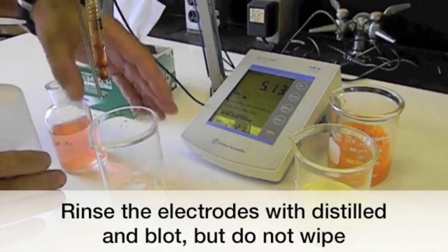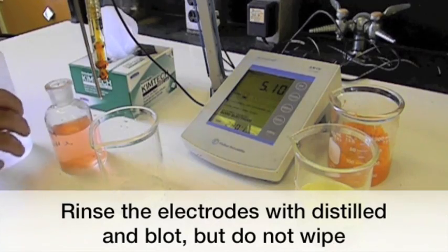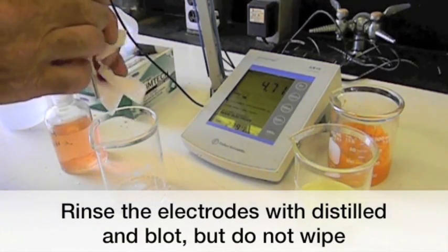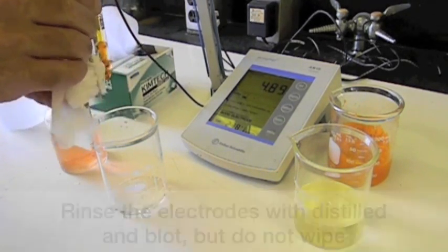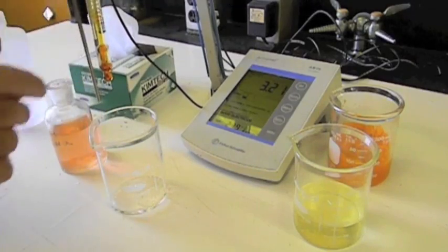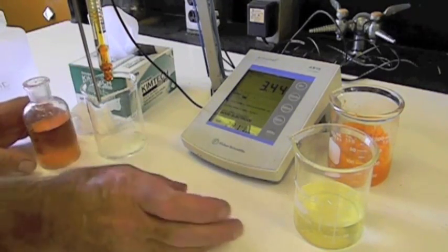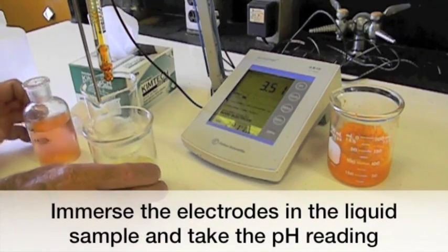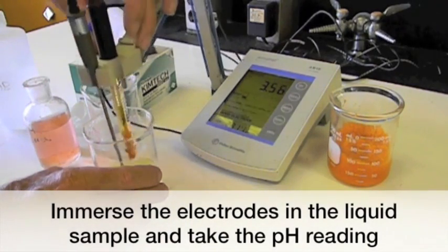Calibrate the pH meter and adjust the sample temperature to room temperature before measurement. Rinse the electrode with distilled water and blot. Do not wipe. Immerse the electrode in the liquid sample and take the pH reading.